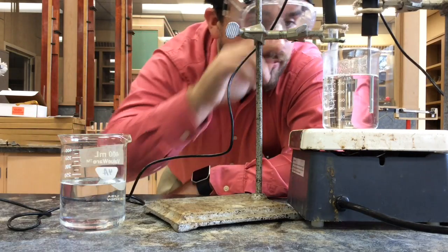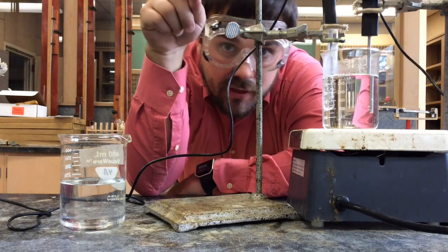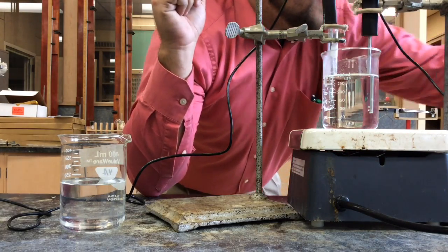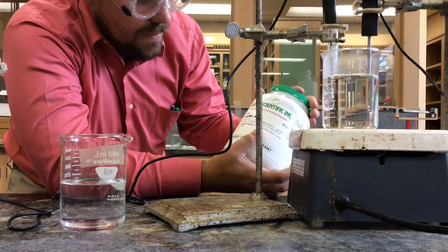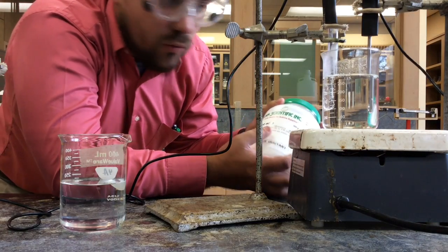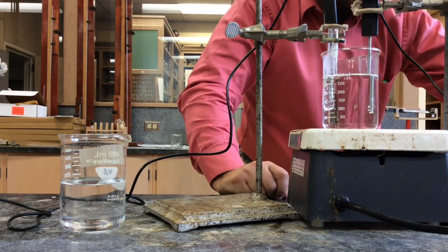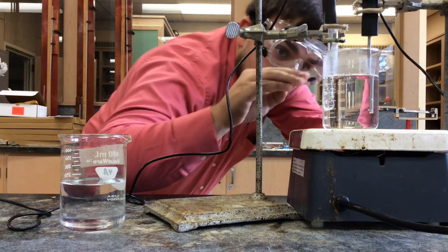So what we're doing is I have a test tube in here of this clear substance. Now that clear substance looks like water because it's clear, but it's actually not. It's lauric acid. Now lauric acid has a melting point or freezing point, whatever you want to think of it as, of 43 to 45 degrees Celsius. Right now, we're sitting at about 88 degrees Celsius, and so it's above its melting point, so that's why it's a liquid. And so it's this clear liquid.